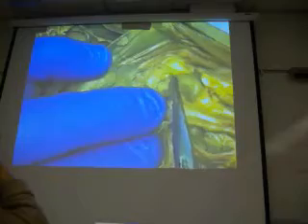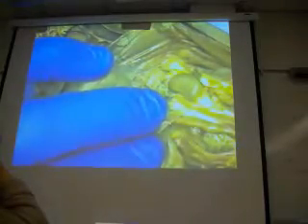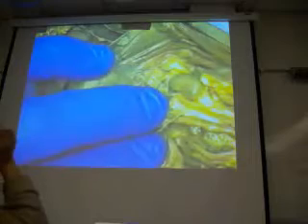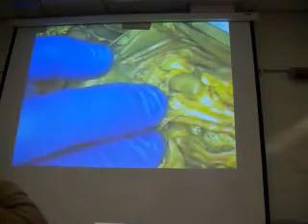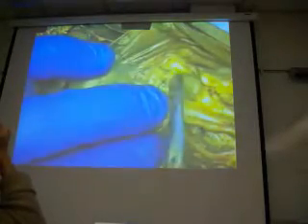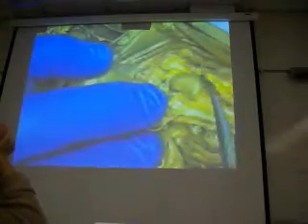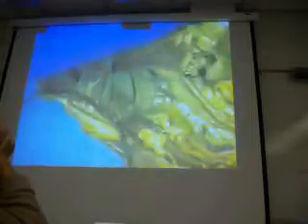Here's a kidney right here. So see this structure right here? Here's the kidney. And sitting on top of the kidney, see this little gland that's right there? Oftentimes when you're identifying, or if you look at diagrams, it'll say suprarenal gland. That's also known as the adrenal gland. So here's where your norepinephrine, your epinephrine, and so forth come from. Suprarenal gland, or excuse me, the adrenal gland. Same position in us.